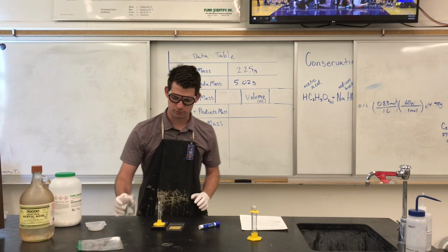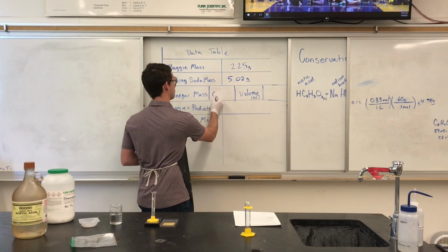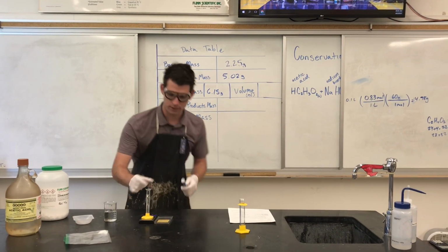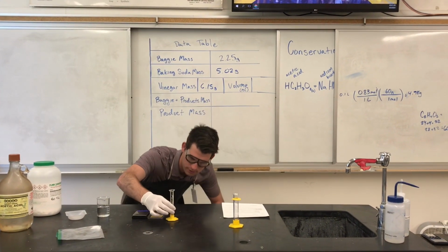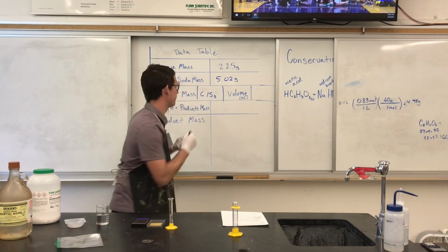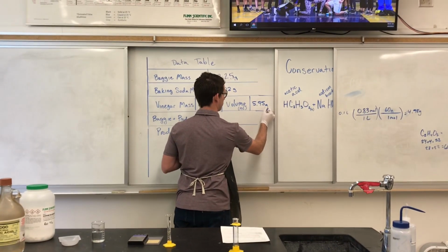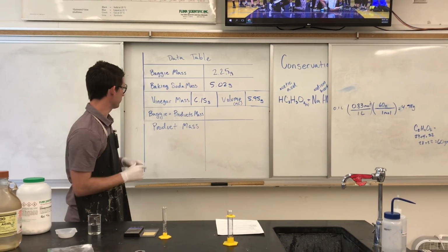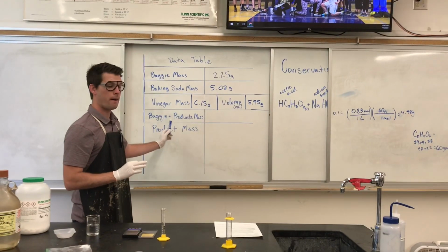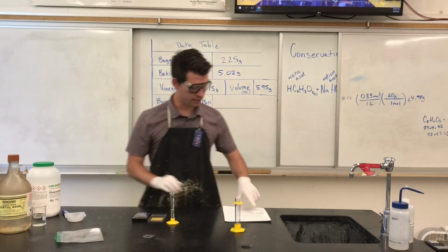I'm just going to fill it up to, looks like 6.15 grams. And our volume is, if we look where the meniscus is, let's go with 5.95. 5.95 grams.